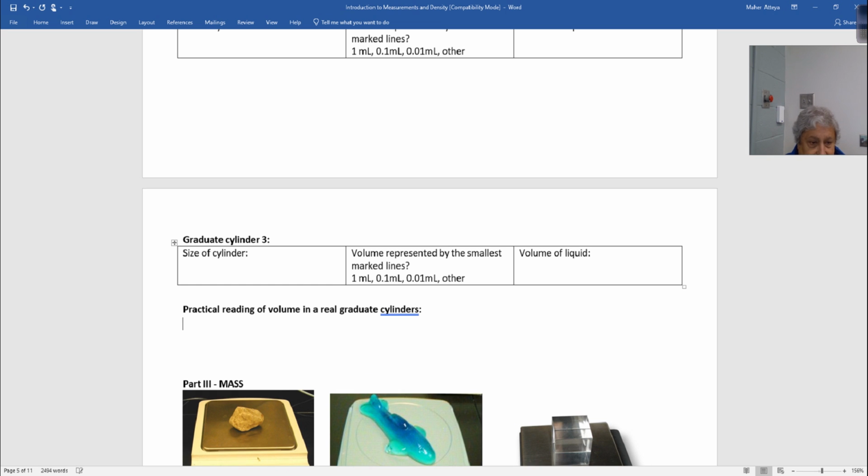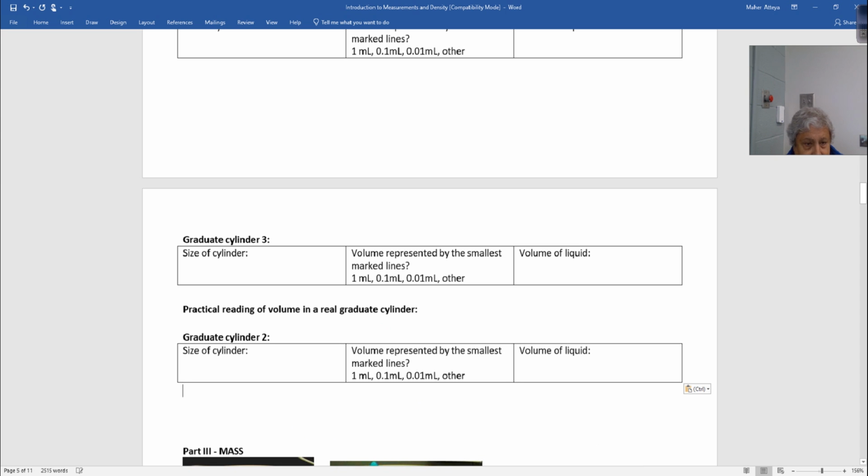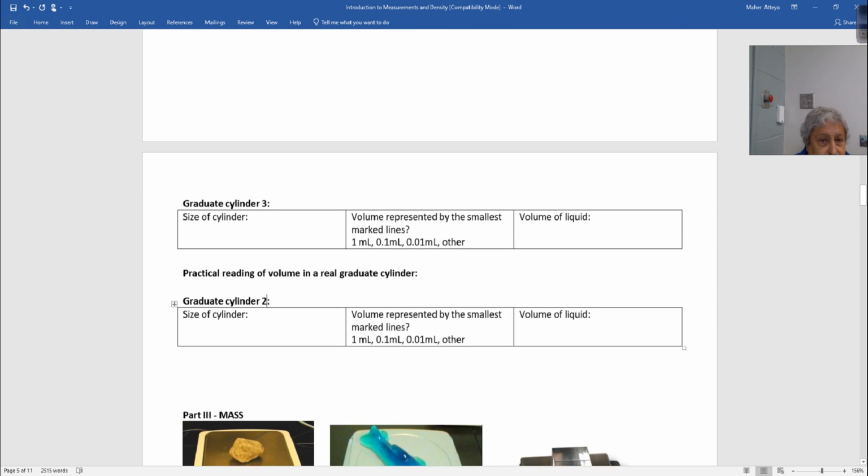So you will do here, guys, copy. I'll put this one for you guys. Copy, paste. Oh, I thought it understood number 2 we were going to do. Scroll up.